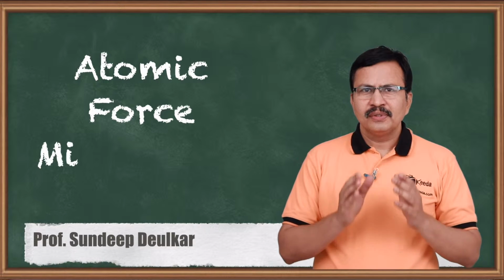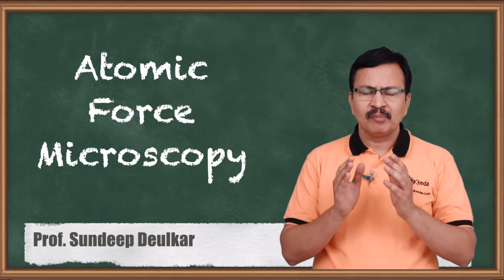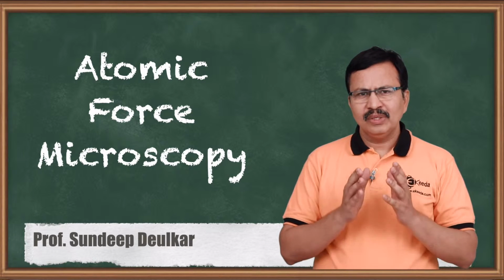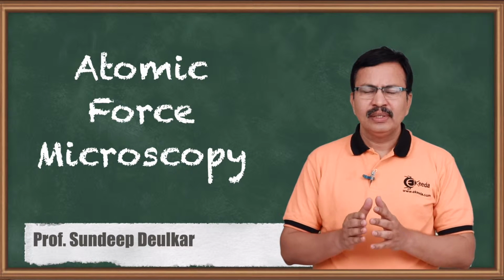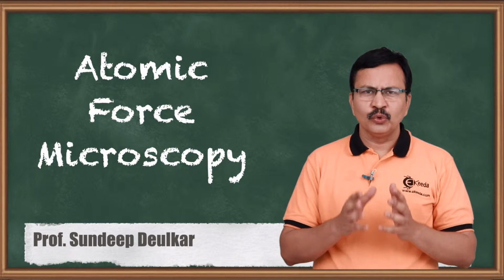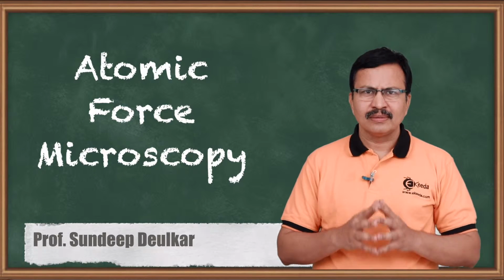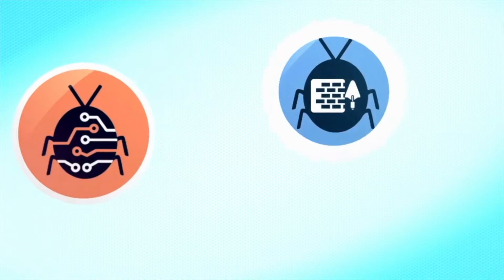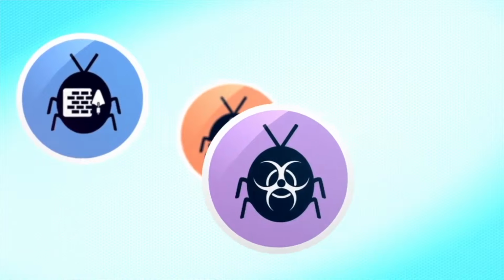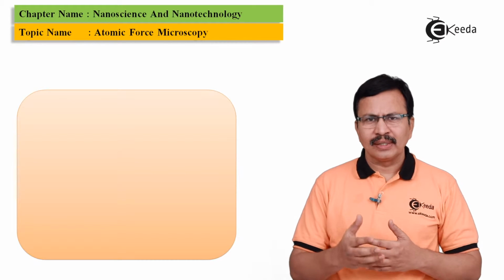So dear students, today we are going to learn about atomic force microscope. So basically what is an atomic force microscope? This is a surface analysis technique which is used for characterization of nanomaterials. Now how does this work?